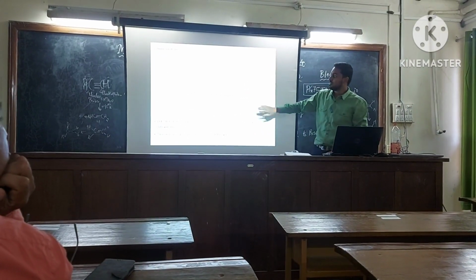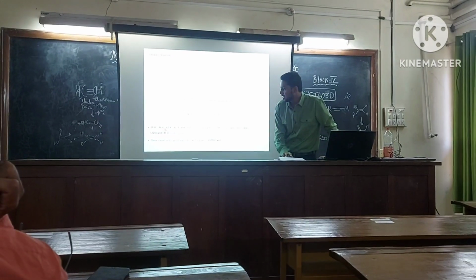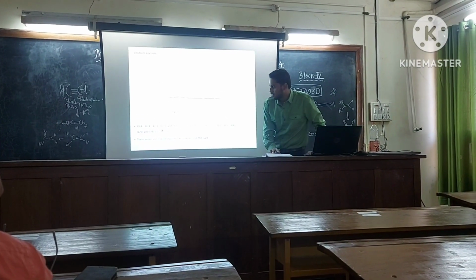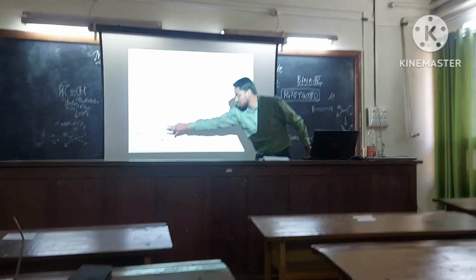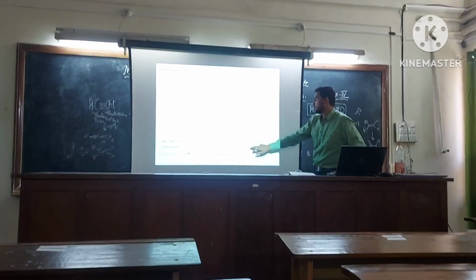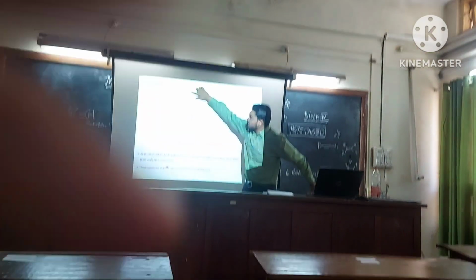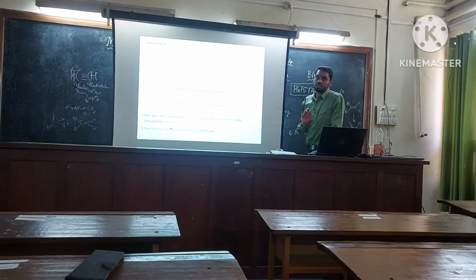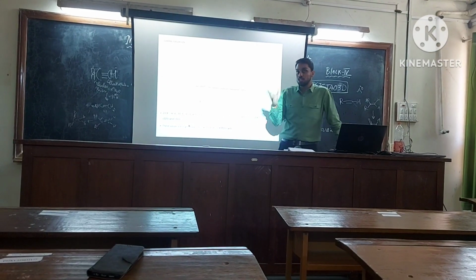The first characterization method is powder XRD. These are the diffraction angles, 29.8, 36.4, 42.4, and for the corresponding angles we got the Miller indices 110, 111, 200, and so forth. The 111 and 200 peaks are the prominent peaks, which tell that Cu2O, that is copper +1, has formed.